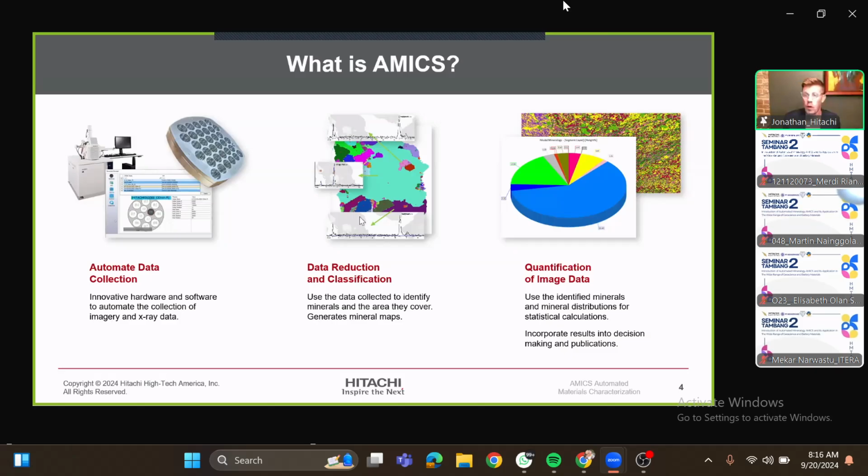But the important thing for our discussion here, to understand how automated mineralogy and materials identification is used in the industry, is to understand that it translates those image data to numbers. It makes it so that we can have, yes, these beautiful false color mineral maps, right, or material maps, but also we can have real data. So we can look for trends, we can look for anomalies, and we can understand and quantify our material composition.